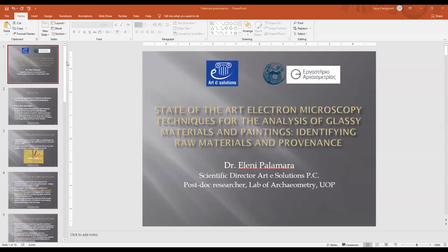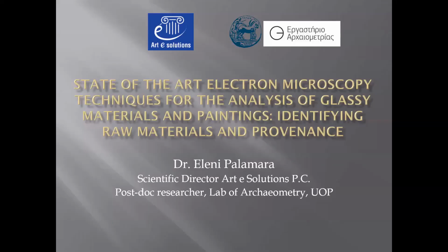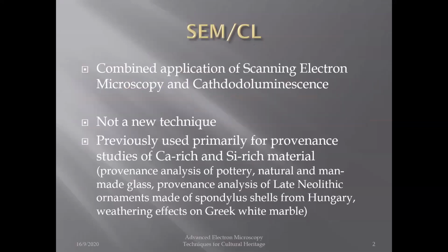Hello everybody, good afternoon. I hope you can hear me clearly. So following this excellent discussion by Dr. Das regarding the potential of transmission microscopy and its vast area of applications in cultural heritage, I would like to move us back to something that most of us are more familiar with, scanning microscopy. Only scanning microscopy with a twist. So I would like to discuss a combination of scanning electron microscopy with cathodoluminescence.